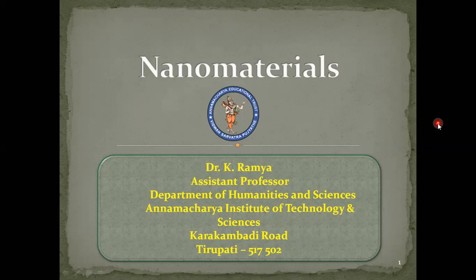The two characterization techniques we are going to discuss in this session: one is XRD, X-ray diffraction, that gives a structural analysis, the structural arrangement, how the material has been formed. Is it the design structure we have needed, or are any other phases present in the material apart from the phase we opted for, and hence whether the structure has changed or not. All these details are given by X-ray diffraction.